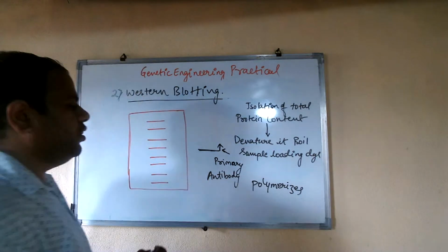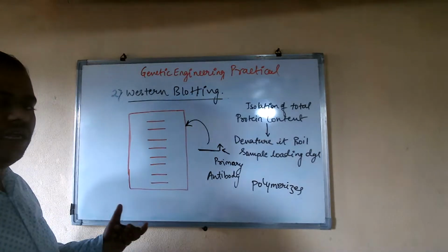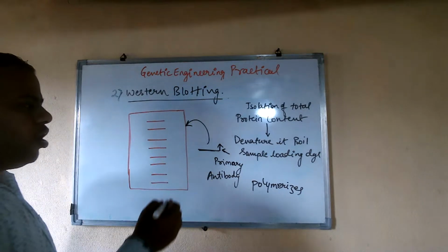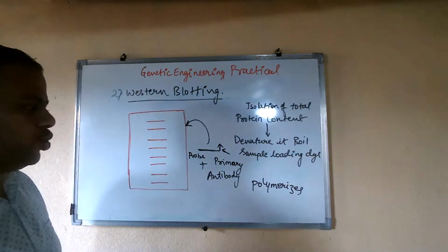Now the membrane is washed with the solution of the primary antibody along with the probe. Probe plus primary antibody solution is added.